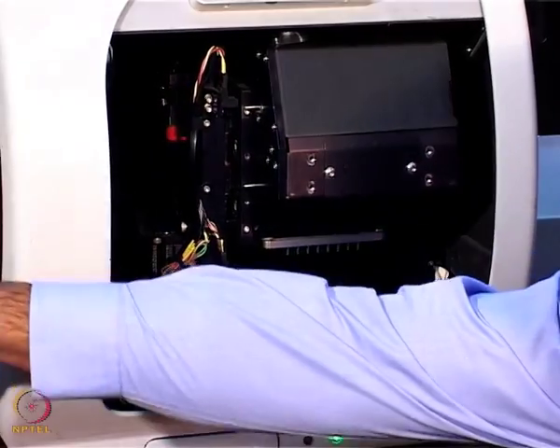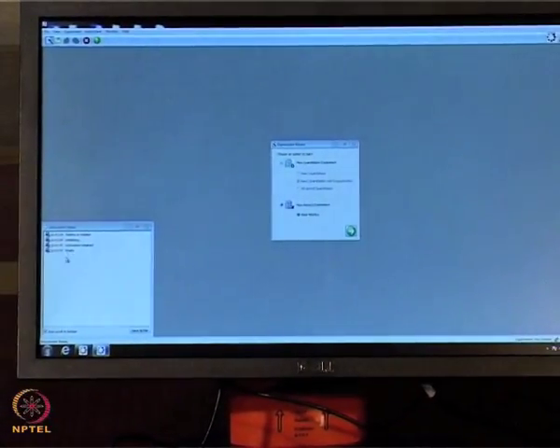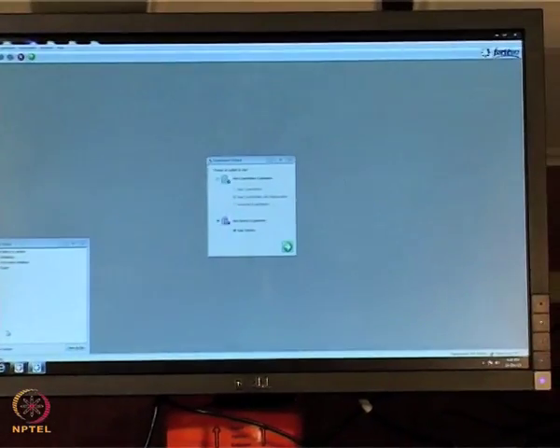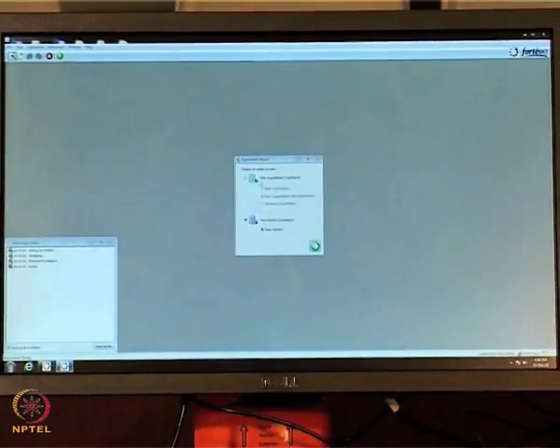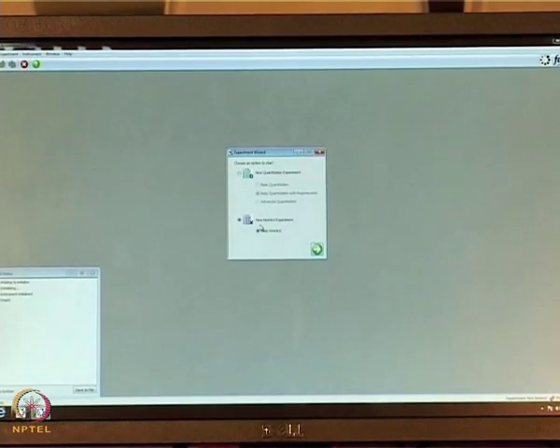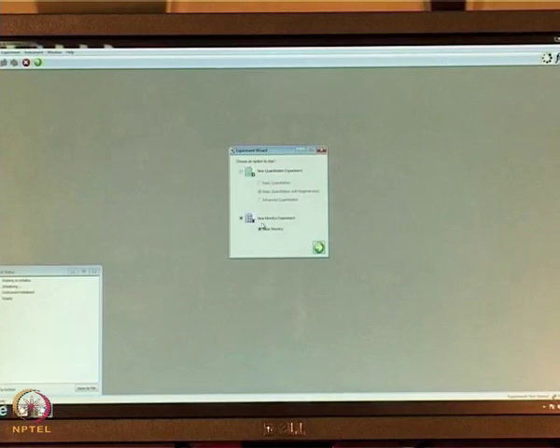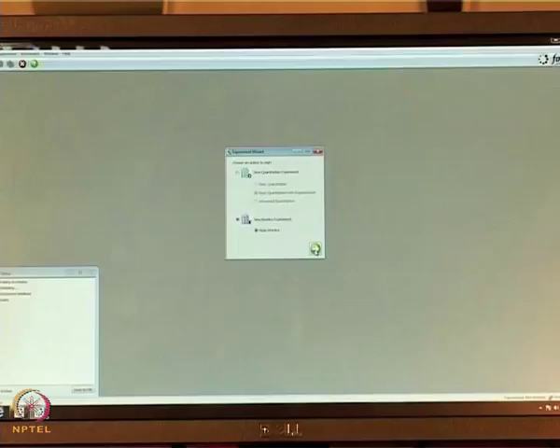You can see in the software what event is happening in the dialog box that opened. Now it is showing that the instrument status is ready. So now we can start the experiments. When the acquisition software is open, we can see there is an experimental wizard here. In the wizard we can see there are two major experiments, whether you want to do a kinetics experiment or a quantitation experiment. Now we are going to perform the kinetics experiment. I will go ahead by clicking on this green arrow mark.